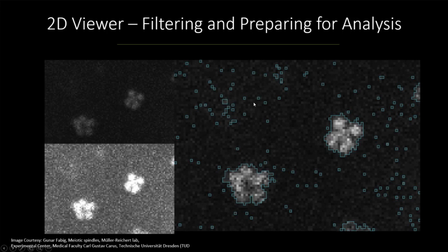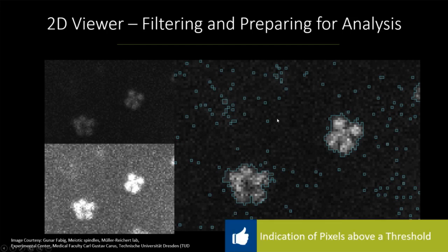Of course, we can later on do something like filter out all the small objects and keep the big objects, but what does it mean? It means we have to do some computation. So how could we skip this? How could we apply a simple filter to the image and solve the problem?